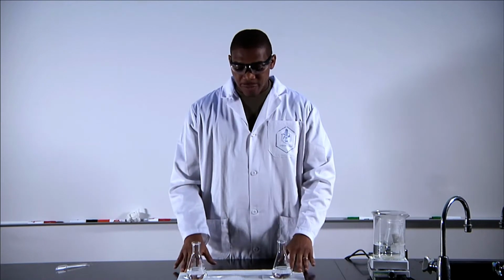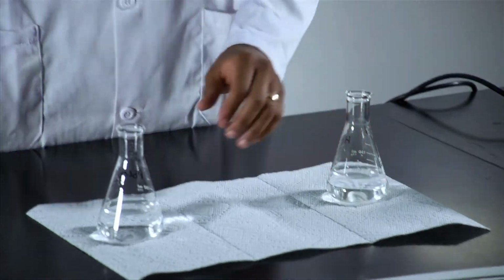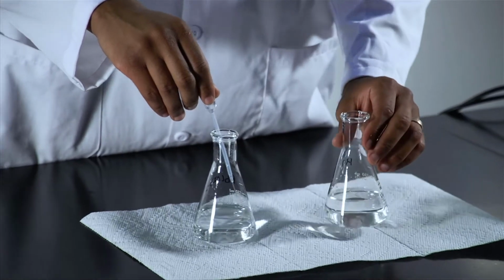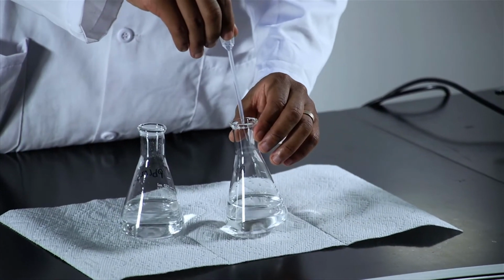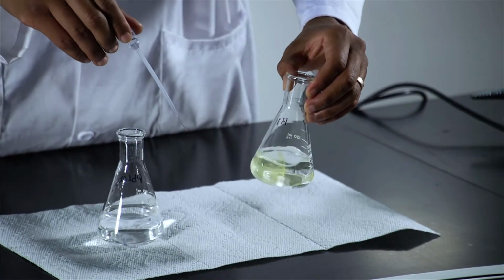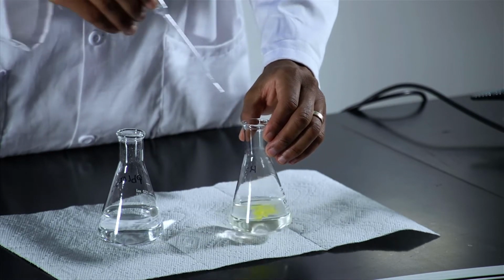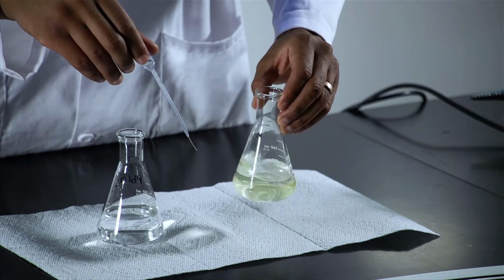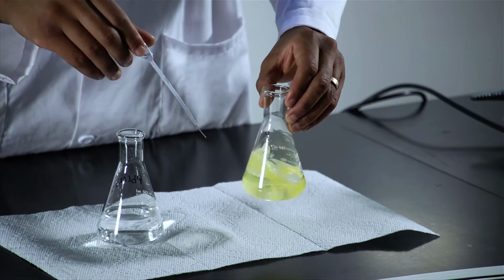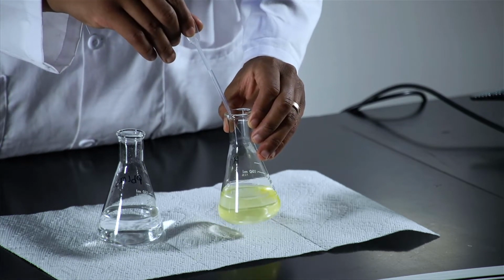Okay, so I have my lead nitrate here as well as my potassium iodide. I'm going to use a pipette and start to add just a couple of drops into the potassium iodide. We start to see the formation of a yellow compound in there. That's the lead iodide now in the product form. And again, as of right now, we don't have much of it, so you can see it's still hanging around in solution, but as you start to add more, you can see that it's slowly starting to crystallize in the solution.